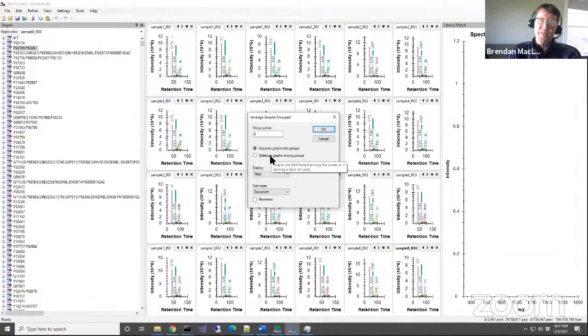Yeah, what do I actually want to do? I think 8. So I'm looking at the data and it's in triplicate. So I see R1, sample 3, each set of samples has 3. So I think I want something more like 6. Maybe I'll go ahead and force them into a row. That's going to be too thin, I think. I guess I'll just let them be tiled.